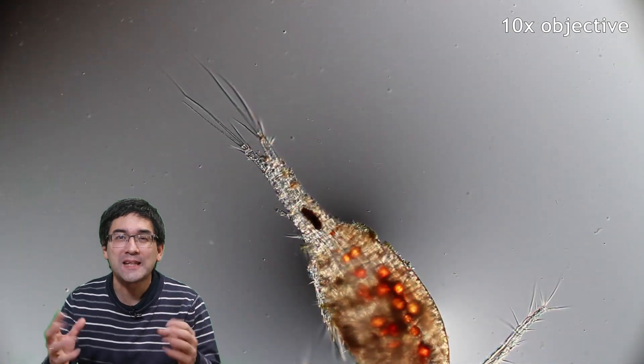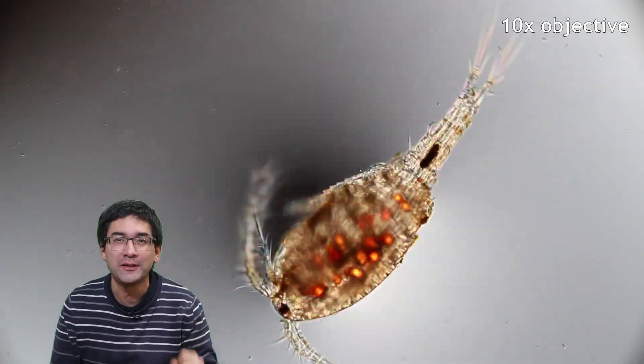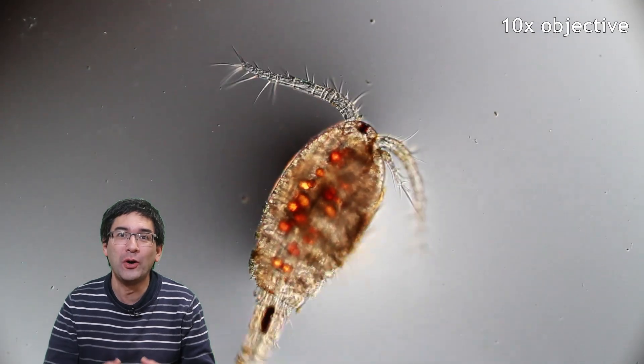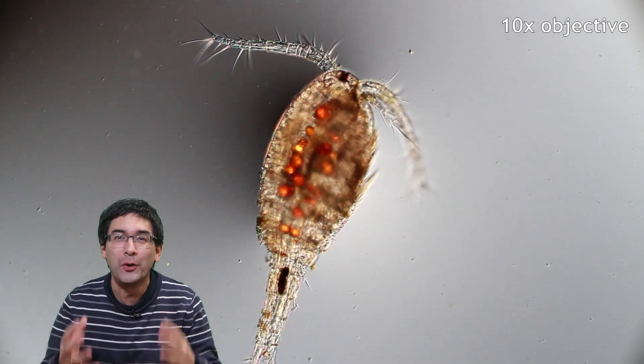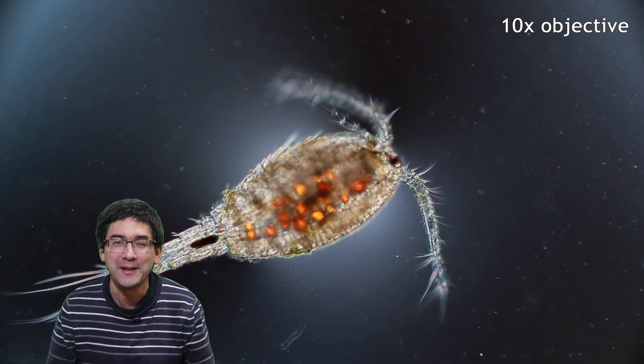Cyclops is called Cyclops because it has only one eye — you may be able to see the dark dot on the head of the little organism. Cyclops is also the name of a mythological Greek monster which likewise has only one eye on its forehead, which is why the name was chosen.